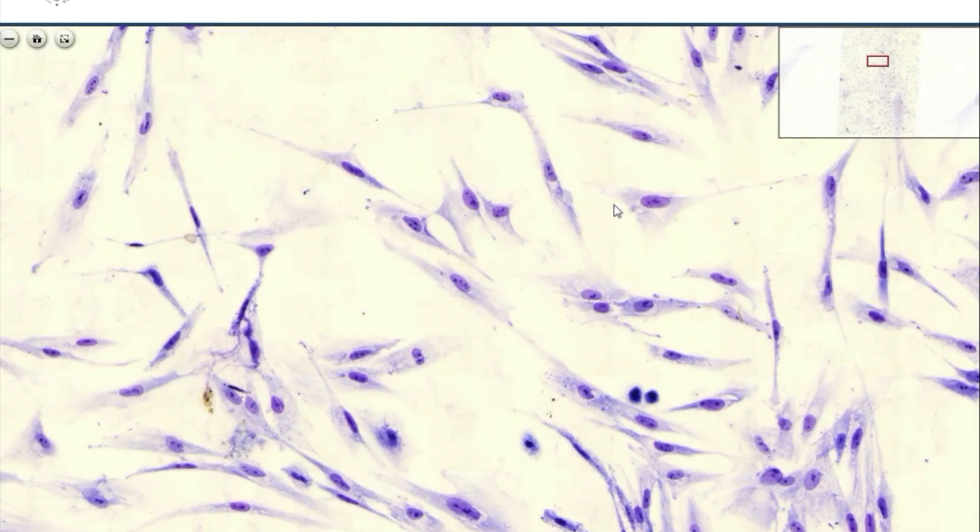If you enlarge an area in this slide, you will see cells which have larger cytoplasm, have processes, and you will see narrow and even narrower cells. These very narrow ones we could call the fibrocytes. The thicker ones are the fibroblasts. There is no strict line between these two groups of cells — both of them are capable of being transformed into the other type, depending on activity.